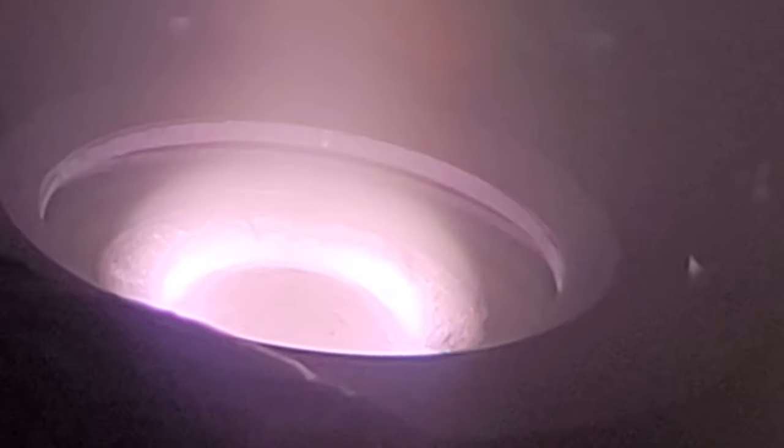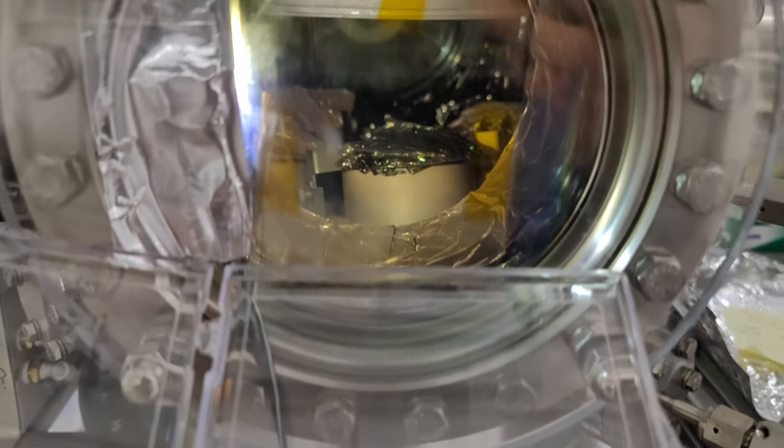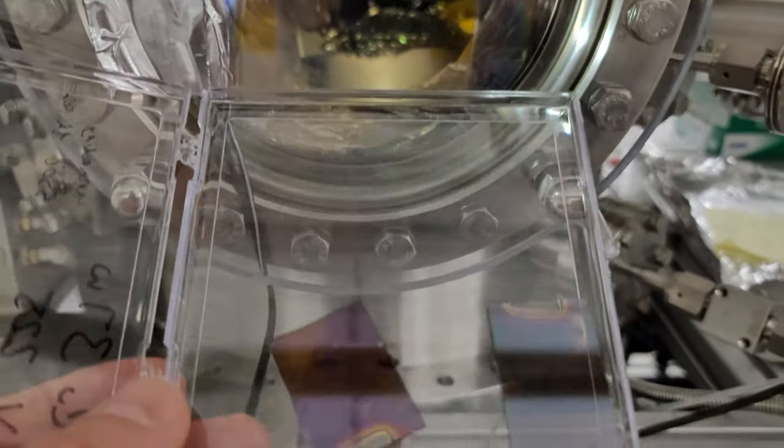Here we are looking at a sputtering process in which copper and bismuth targets are being sputtered in a mixture of argon and oxygen to create a copper-bismuth oxide thin film on a spinning quartz substrate mounted above. This material is being investigated as a photocathode which drives the types of production chemistries referred to earlier.